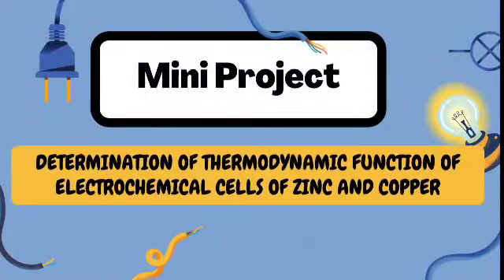Mini project has been done by Group B2-03 with Aisha Suhaidi, Natasha Alias, and Batrisha Faizal. This mini project is about determination of thermodynamic function of electrochemical cell of zinc and copper.